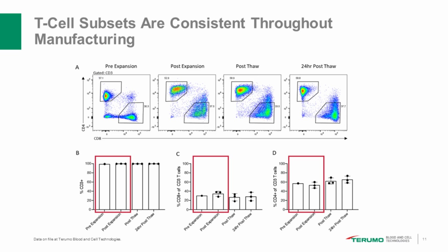And in the last column, you see that samples were rested for 24 hours in culture, and a final piece of analysis was done. The red boxes there just draw your eye to the fact that we are looking at the samples pre and post expansion on the hollow fiber bioreactor.